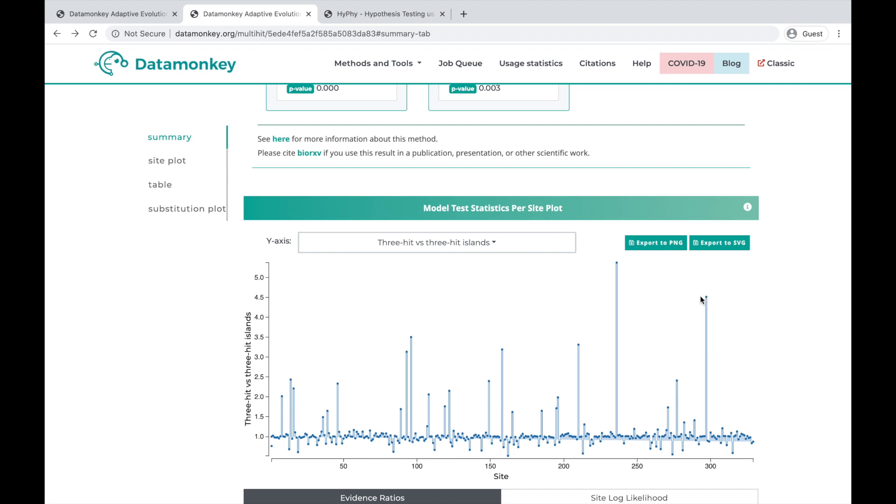This suggests that the signal for the triple-hits is spread across the gene, but evidence for islands is restricted to a few sites.